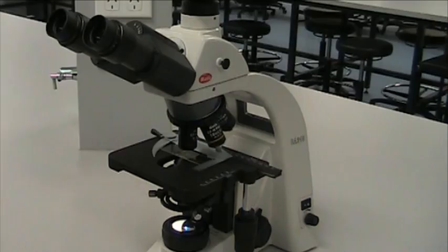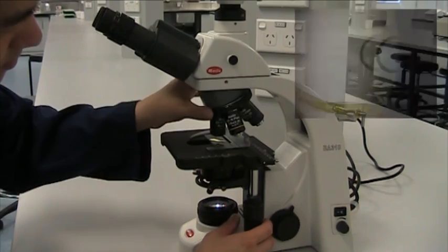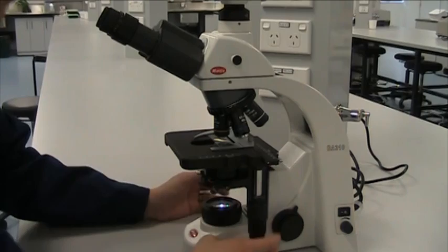The microscope is now set up for Köhler illumination. If you want to use a higher power objective, rotate the nose piece. The condenser diaphragm needs to be set as you move between each objective.